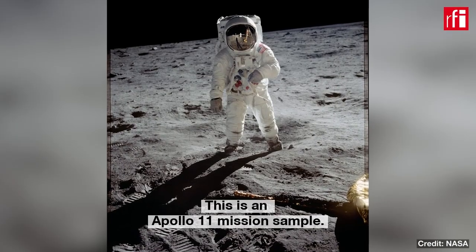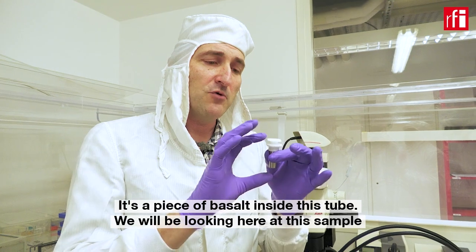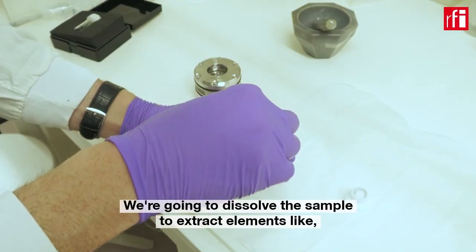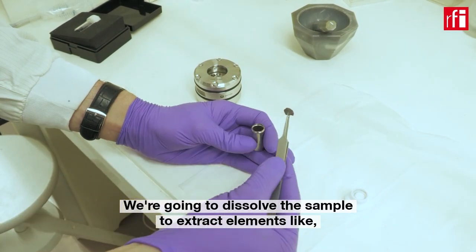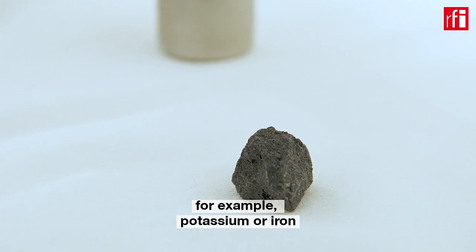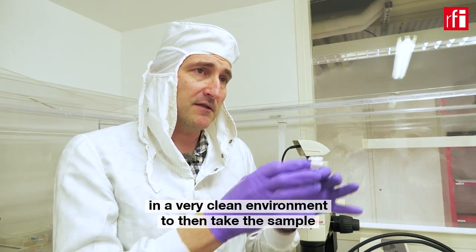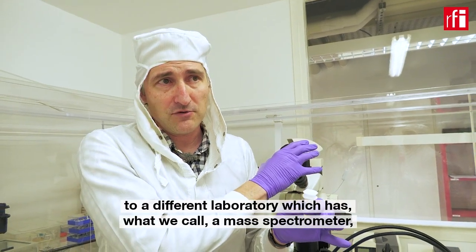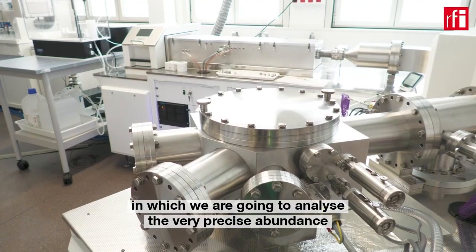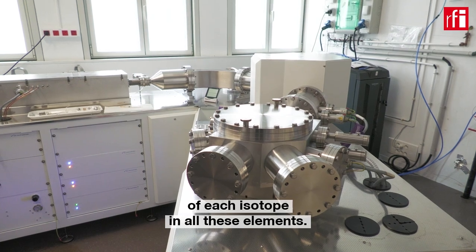This is an Apollo 11 mission sample. It's a piece of basalt inside this tube. By looking at this sample in this lab, we're going to crush the sample and dissolve the sample to extract elements, for example, potassium or iron, in very clean environments. Then we take the sample to a different laboratory, which is what we call a mass spectrometer, in which we analyze the very precise abundance of each isotope of all these elements.